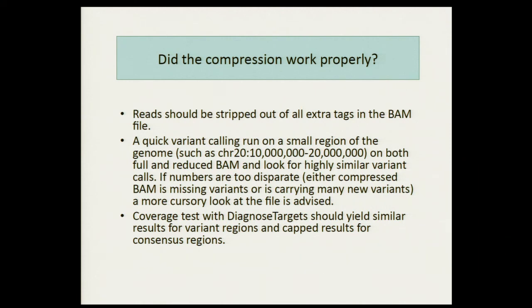Now, good diagnostics are variant calling and coverage tests. If you reduced your file, variant calling should yield the same or very similar results. In all our testing, we achieve very close to 100% sensitivity and specificity on the calls.